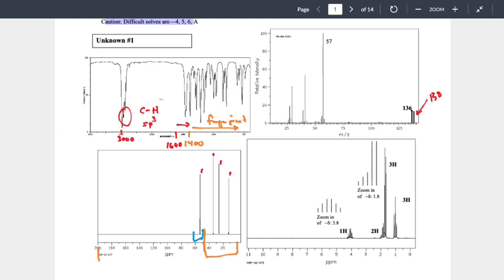Okay. HNMR, we asked the exact same thing. The number of unique hydrogens. So what we now need to figure out is, just like we did with carbon NMR, how many signals do we see? Okay? And I want to kind of be careful with this. I'm changing the language from the way the lecture videos are recorded. I'm referencing signals and peaks. I believe in the lecture videos, I refer to them equally as peaks. Right? And we'll see why I want to call them slightly differently as we move through this.